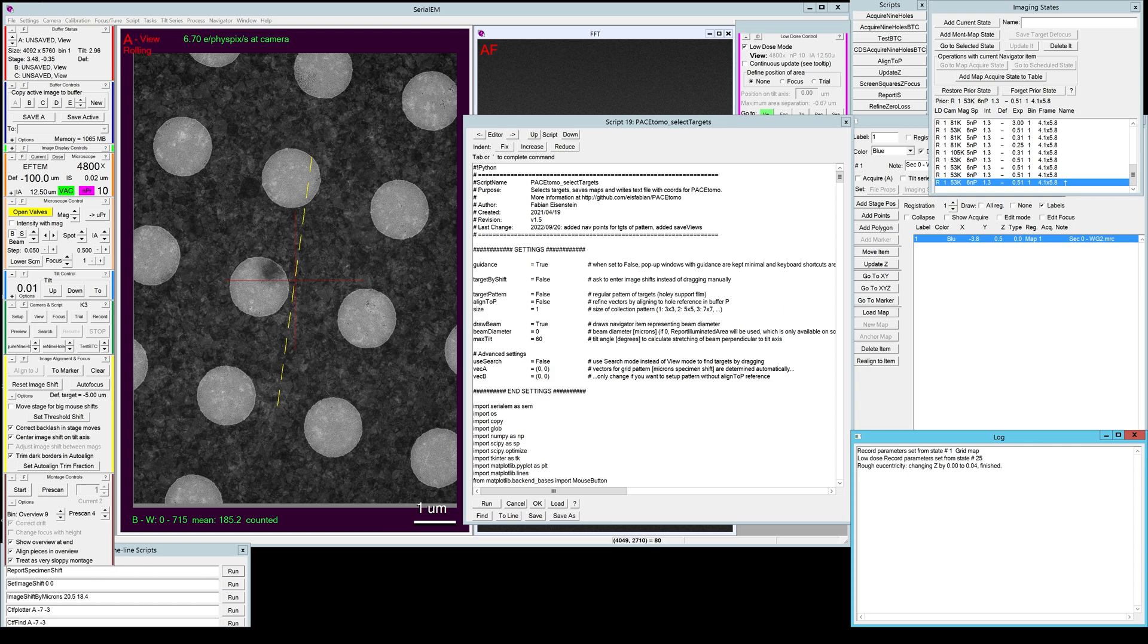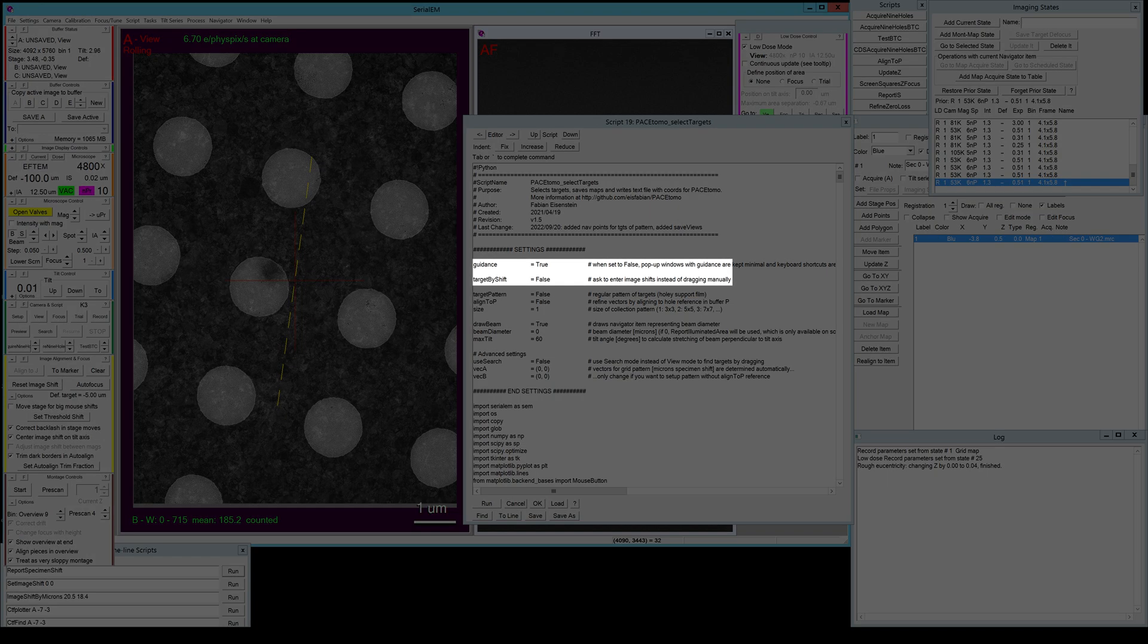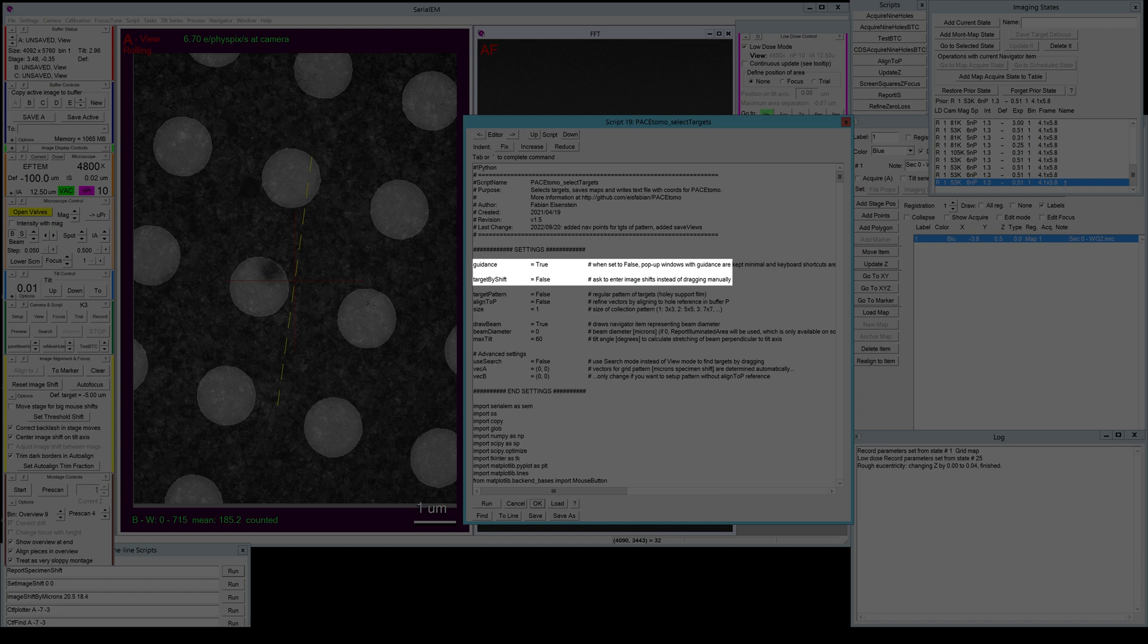To set the targets for a pattern like this you use the same Pace Tomo select target script that you would use for a lamella sample, but you have to change a few settings. We're gonna keep guidance to true so you get some windows that tell you what exactly to do.